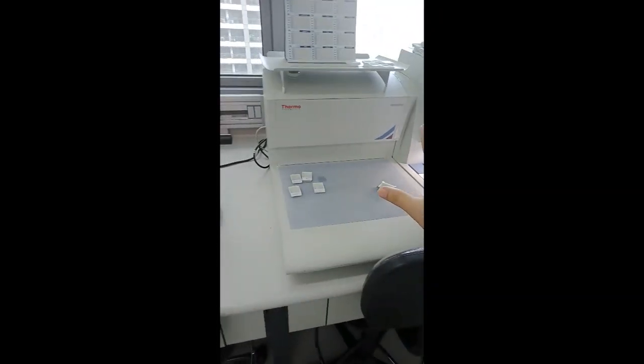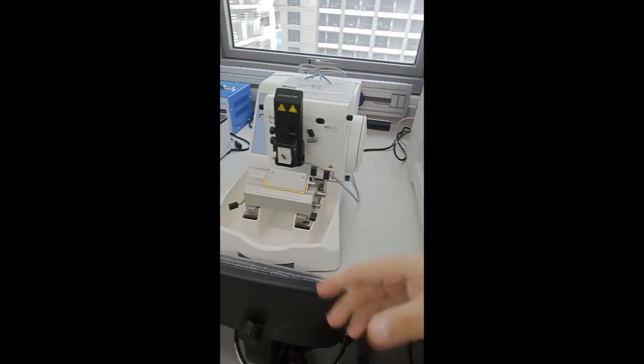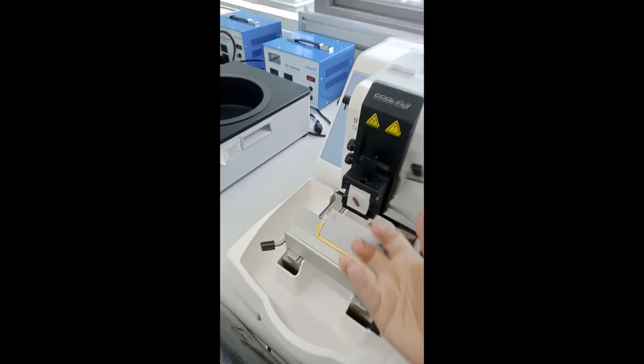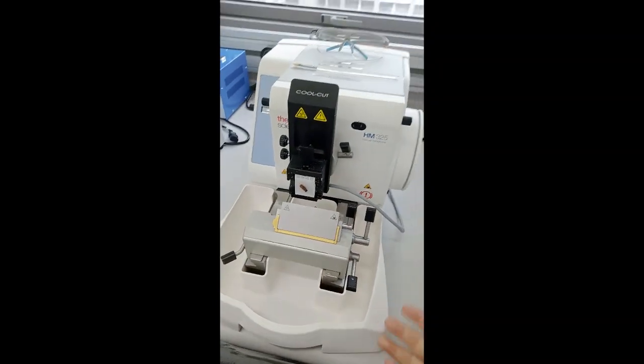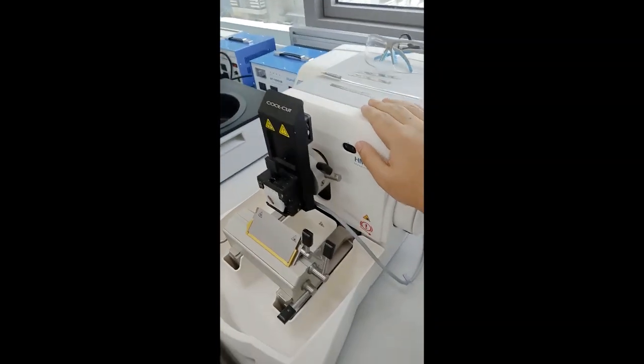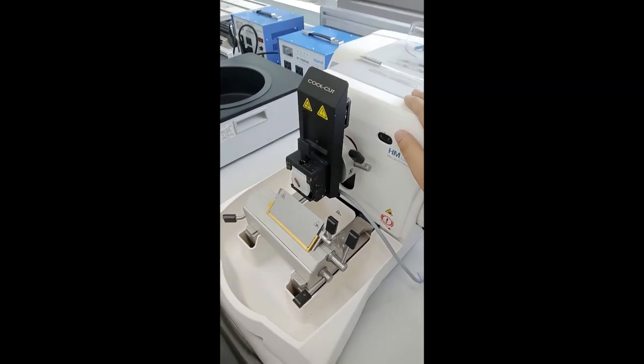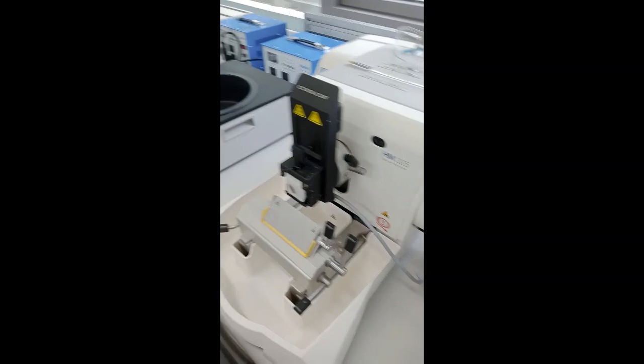When you're done with embedding, you go to the next step, which is tissue trimming and sectioning. This is where the biggest and most important machine for the histotechnologist is. This is the microtome.